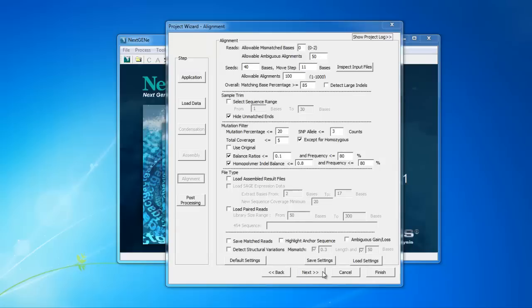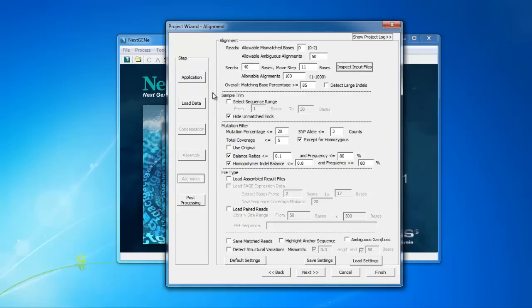On this page, you can select the settings to be used for the analysis. You can click Inspect Input Files to scan your data and adjust the settings in this top section based on the read lengths found in your data.